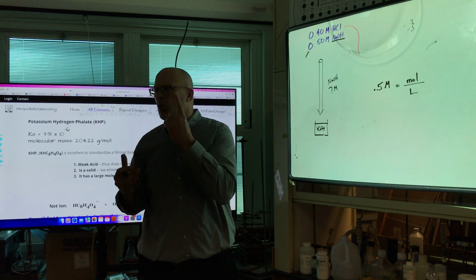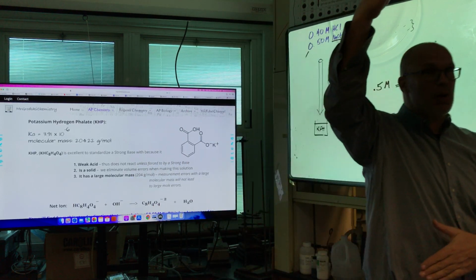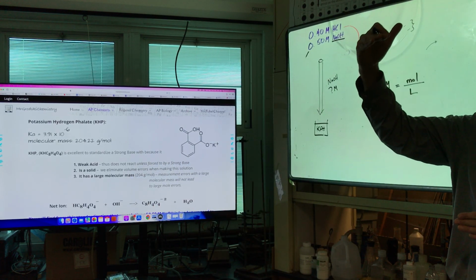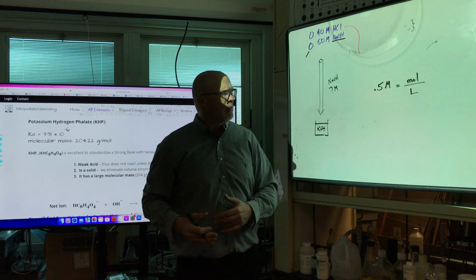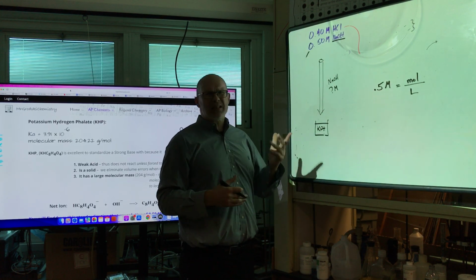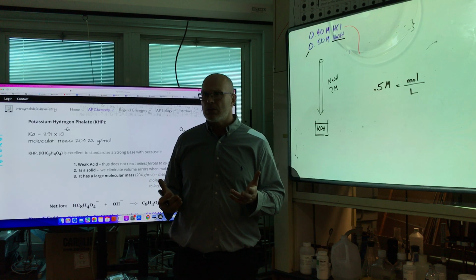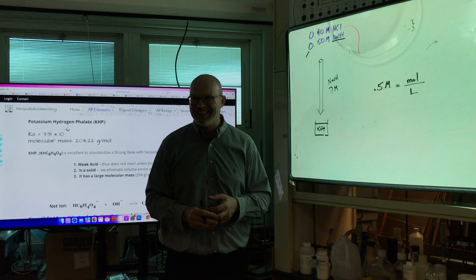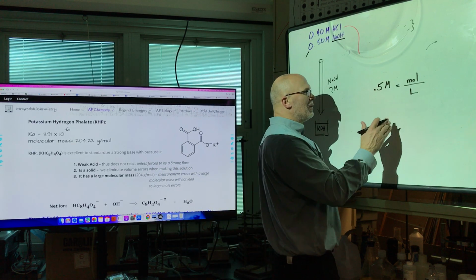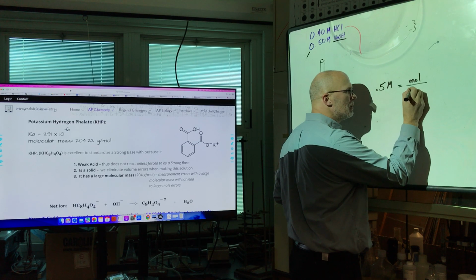We don't want to deliver 1 drop, 1 milliliter. We don't want 200 because we'd have to fill up the burette 4 times. What would be a good number? 20? If we pick 20, now let's do less. How about 10? So if it's 10 milliliters, what's my liters? 0.010.